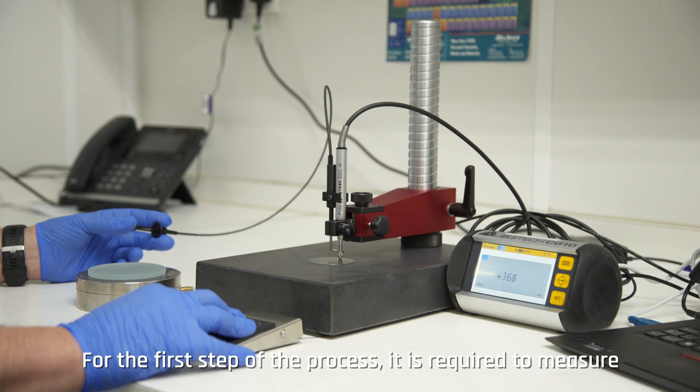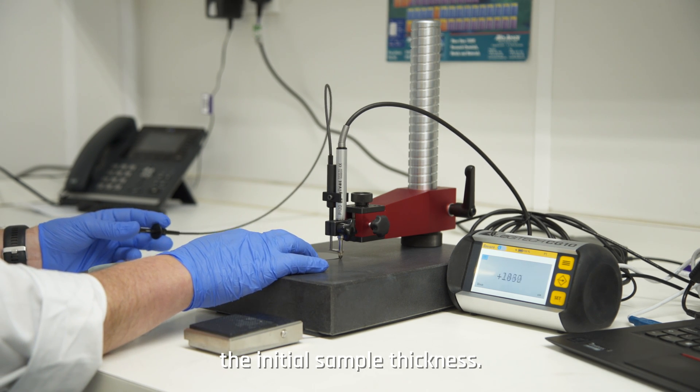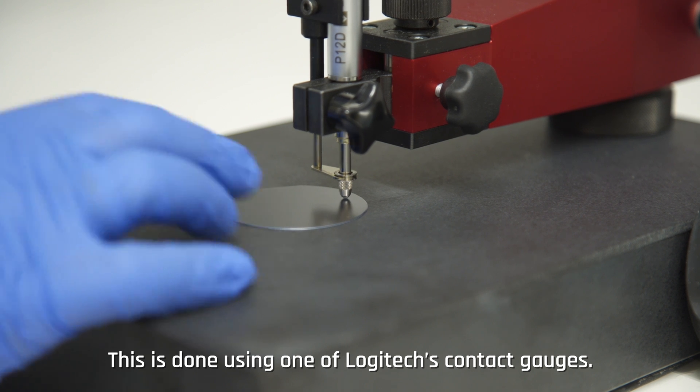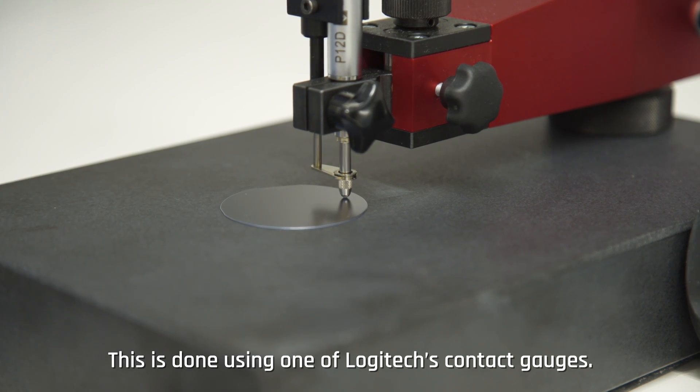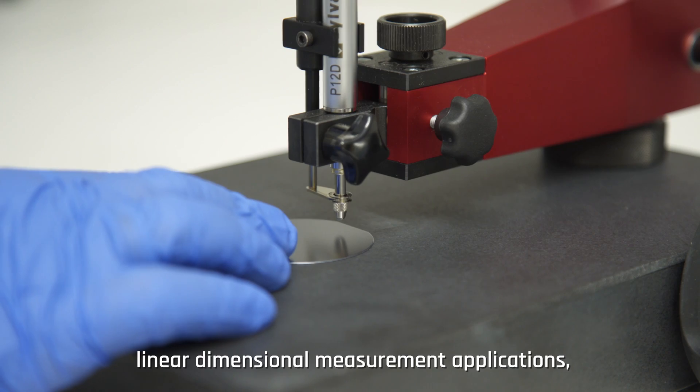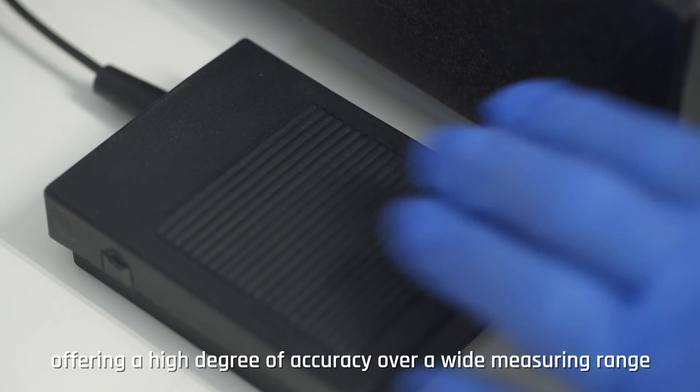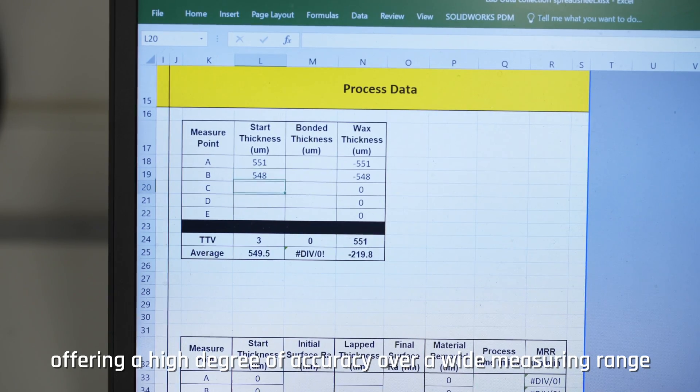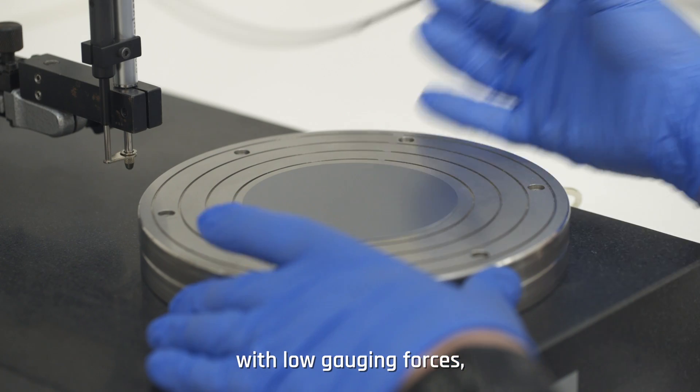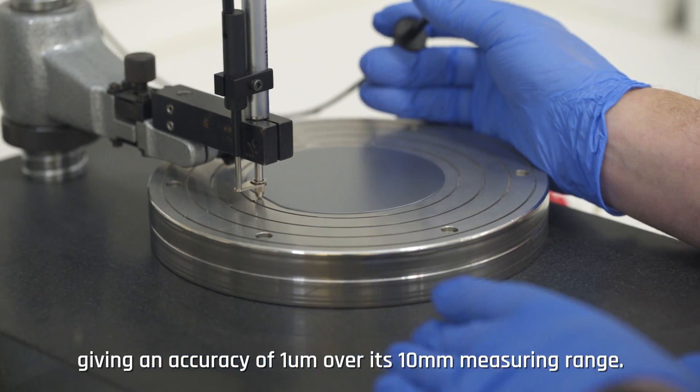For the first step of the process, it is required to measure the initial sample thickness. This is done using one of Logitech's contact gauges. The Logitech CG10 contact gauge is an instrument for linear dimensional measurement applications offering a high degree of accuracy over a wide measuring range with low gauging forces, giving an accuracy of one micrometer over its 10 millimeter measuring range.